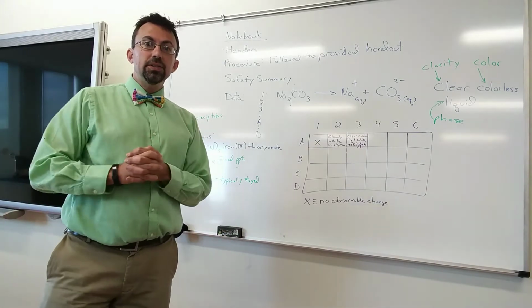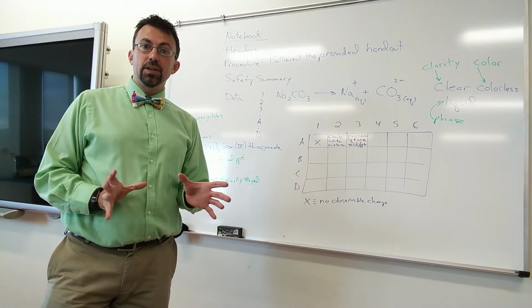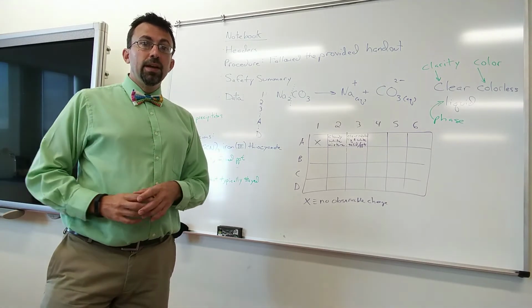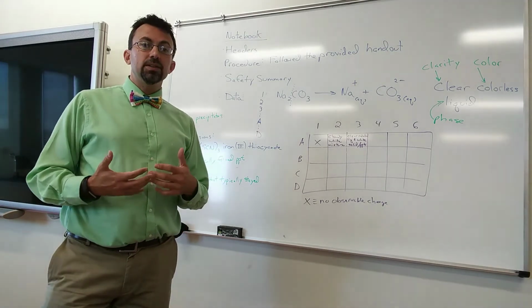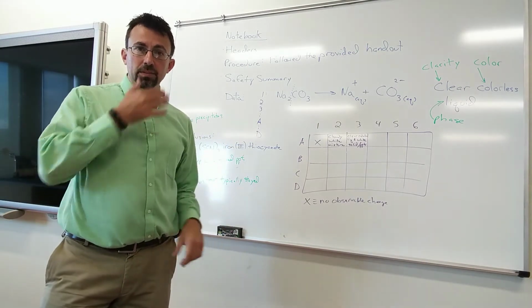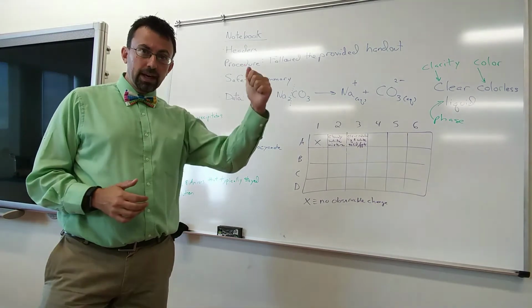So I think the procedure itself in this lab is straightforward enough. I don't actually need to demonstrate on video. You're going to get the wells that are in front of you in the laboratory, and you're going to put a number of drops in each. The number doesn't really matter, it's equal amounts. So whatever the lab says, or you want to just put 10 drops and 10 drops, or 7 drops. It's really not that important, but you put drops of each aliquot on the grid.